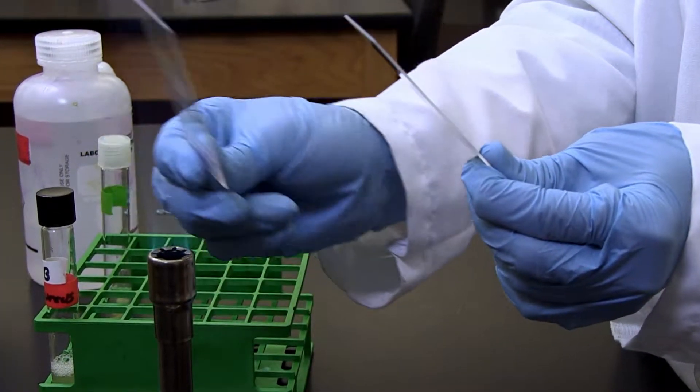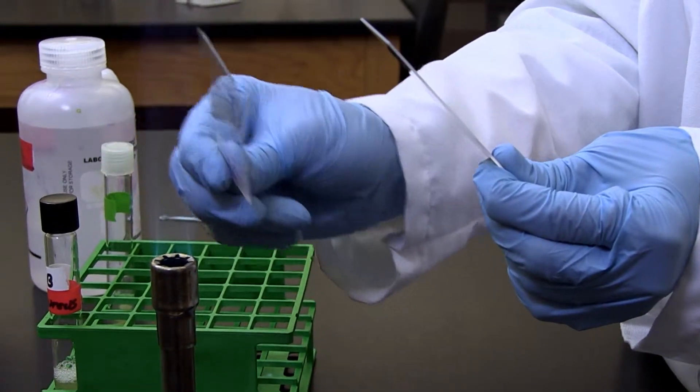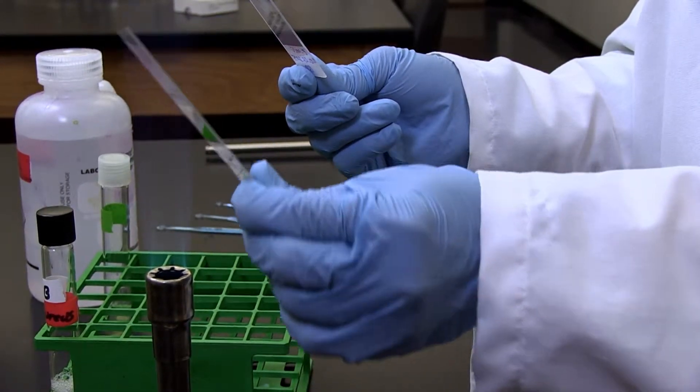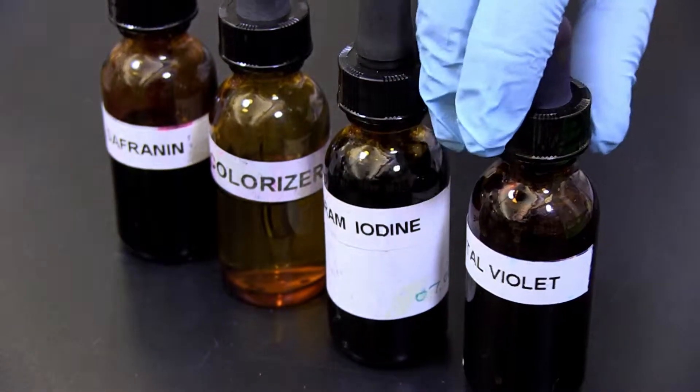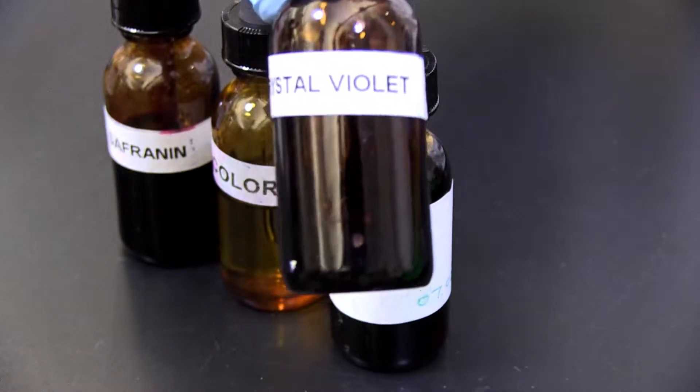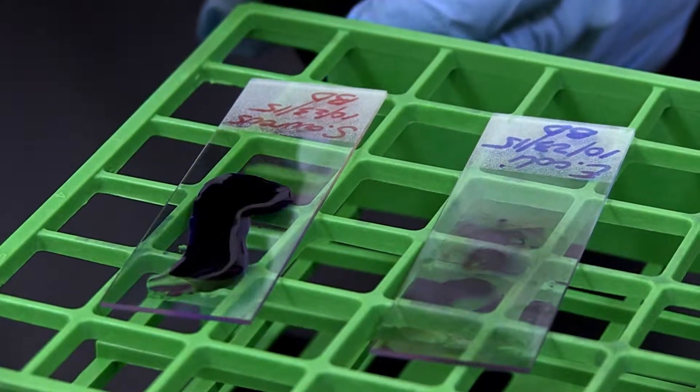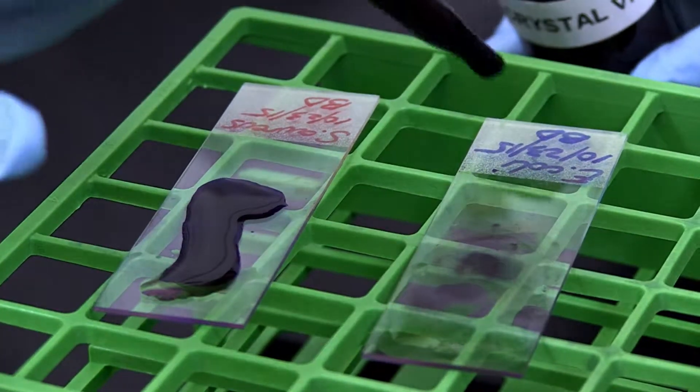To prepare a Gram stain: One, obtain two heat-fixed bacterial smears of S. aureus and E. coli. Two, cover the smears with primary stain, crystal violet, for 30 seconds. If viewed under a microscope, both slides should be colored a deep purple.